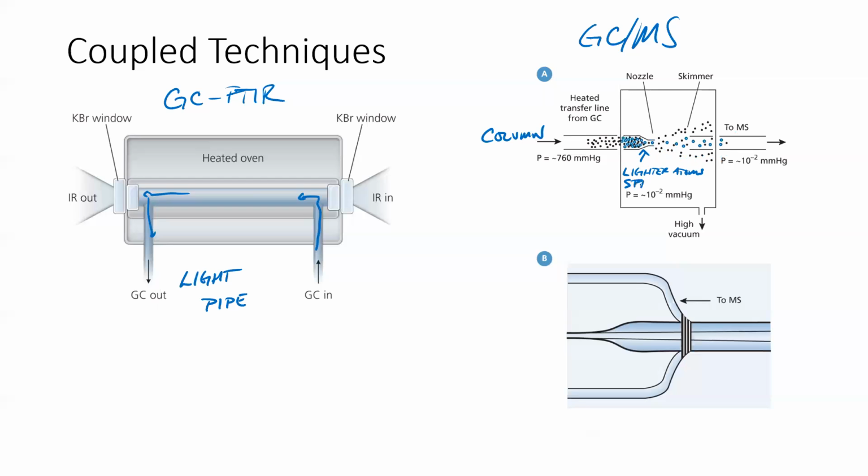Lighter atoms spread more than heavier atoms, right? And since our carrier gas is usually relatively light, helium, sometimes nitrogen, sometimes neon, you know, nitrogen's 28 AMU, neon 20, helium 4, these are usually lighter than whatever we're looking at. And so we lose most of our mobile phase that way, and the mass spec can sort of focus in on and sort of ignore most of our carrier gas.